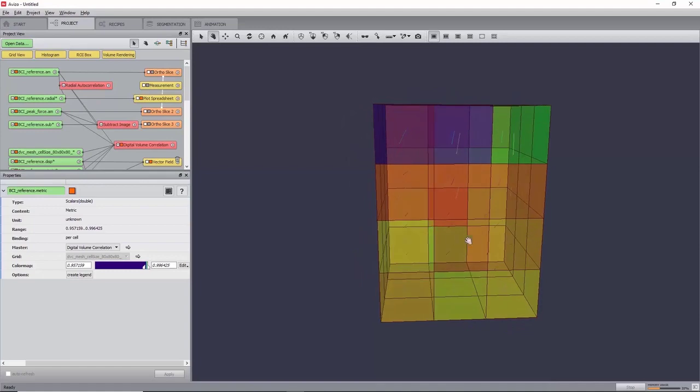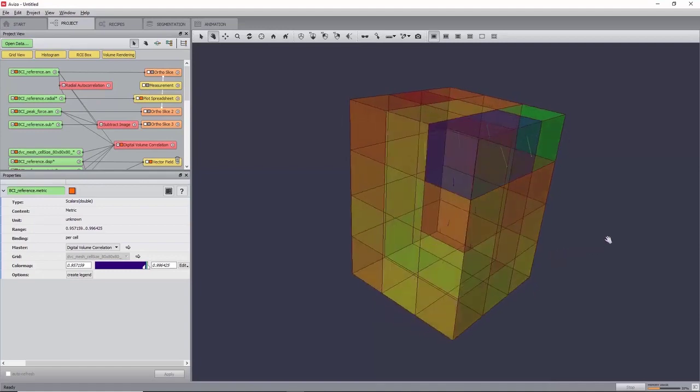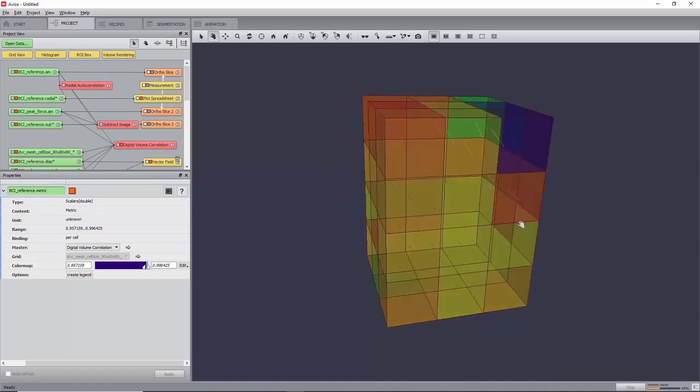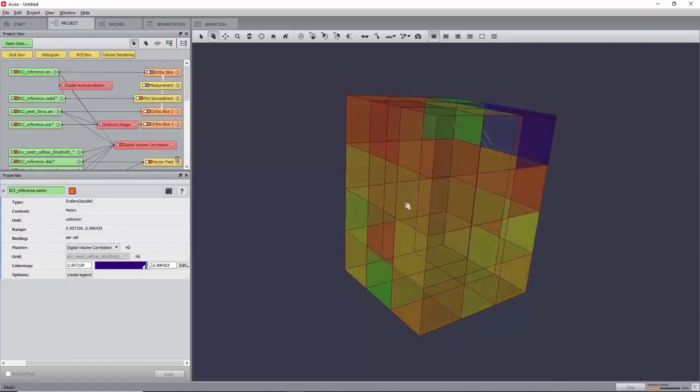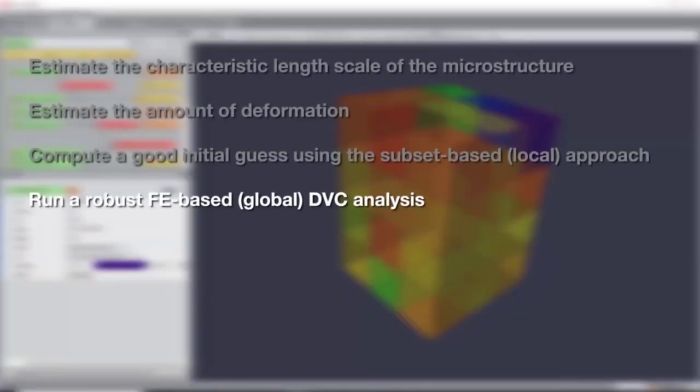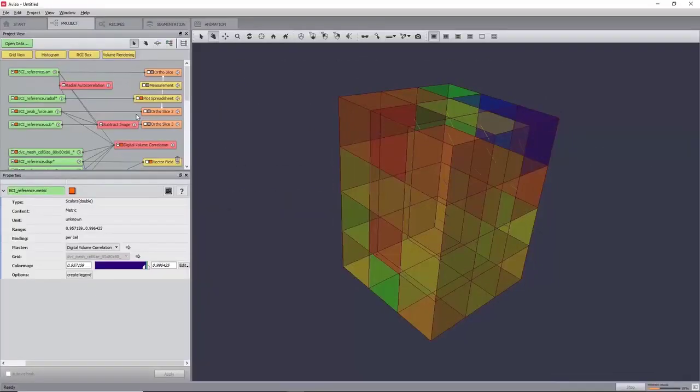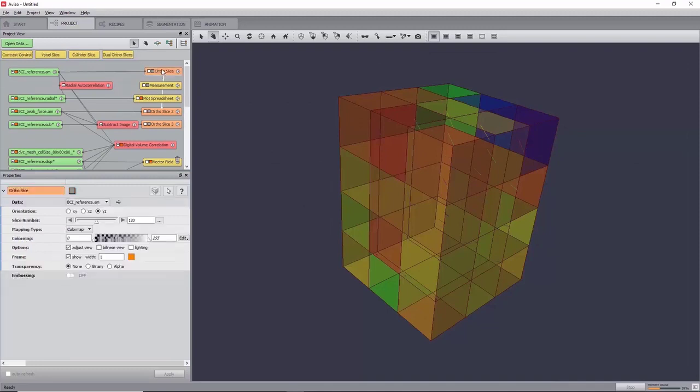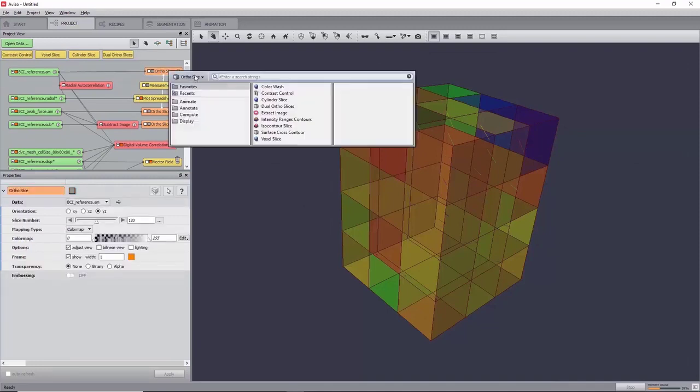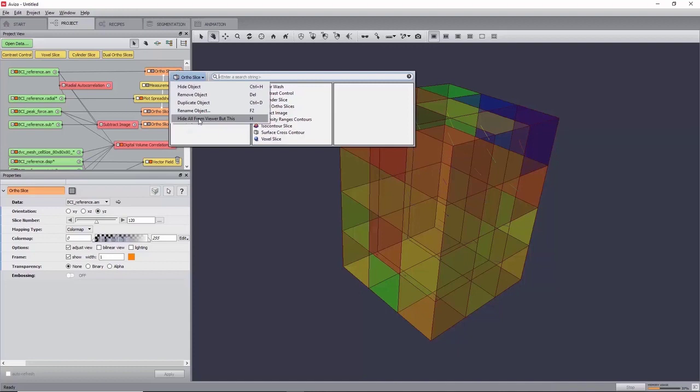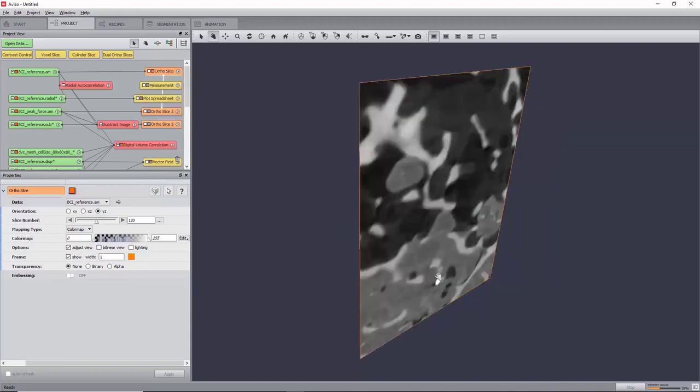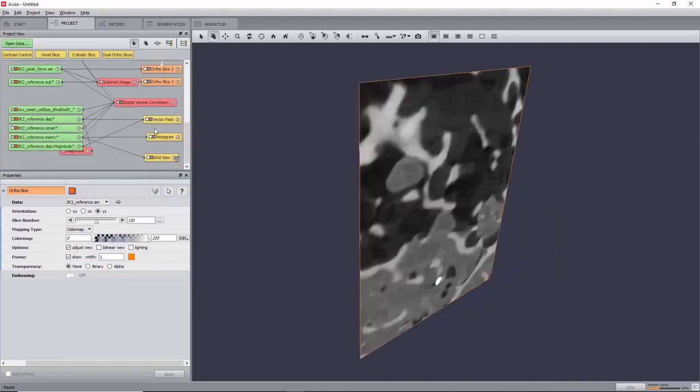Now that we have checked the quality of the displacement field computing using the local approach, it will now be used in order to initialize a finite element based DVC algorithm using a finer mesh, also known as a global approach. Turn off all but one auto slice by clicking right on the reference data set, and click hide all but this.